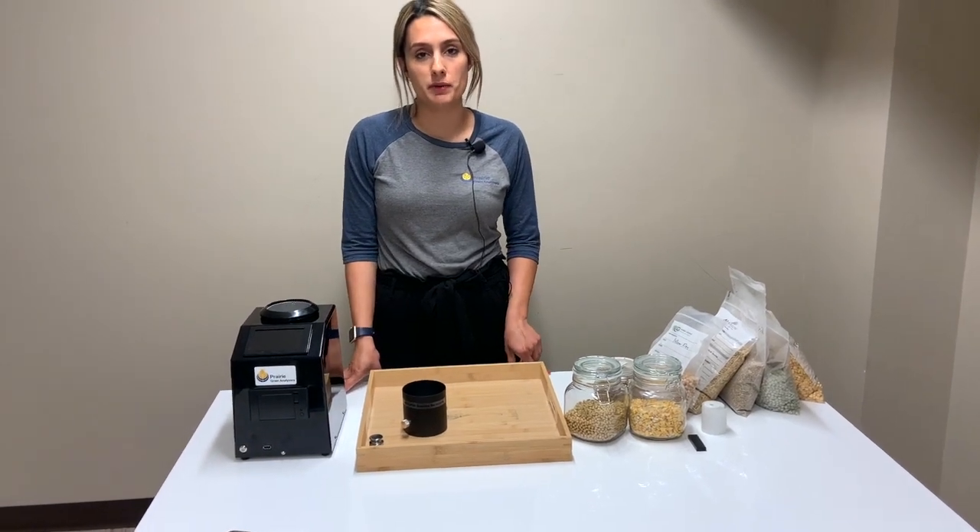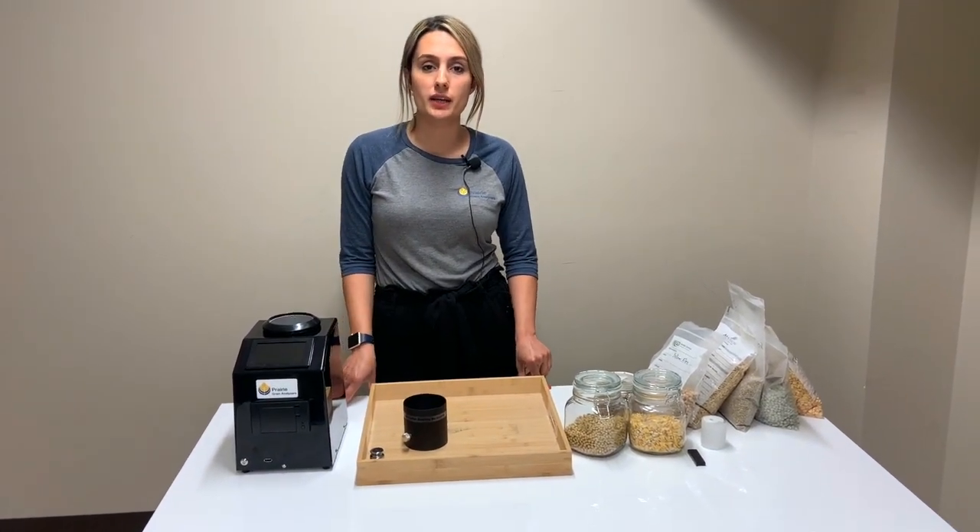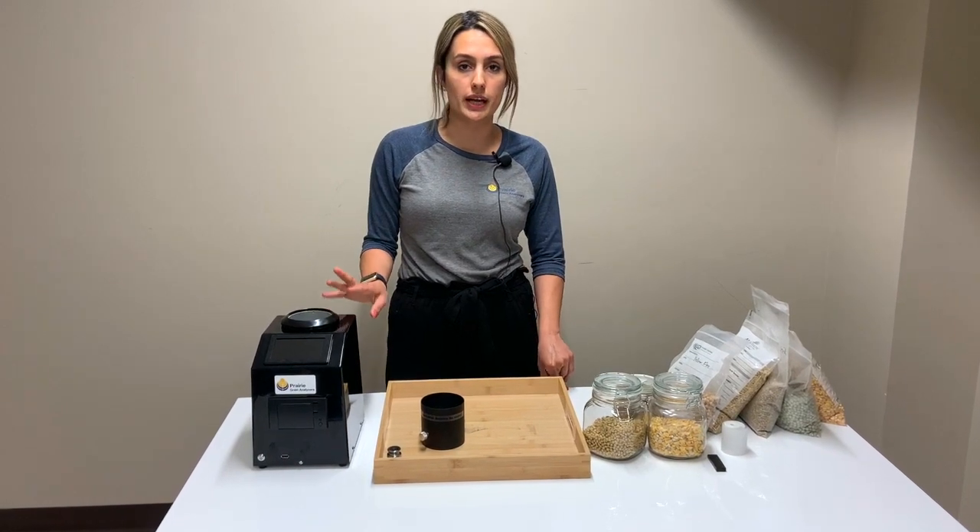Hi guys, my name is Mateen and I'm with Prairie Grain Analyzers. Today I want to show you how to use the MA405 Moisture Analyzer.